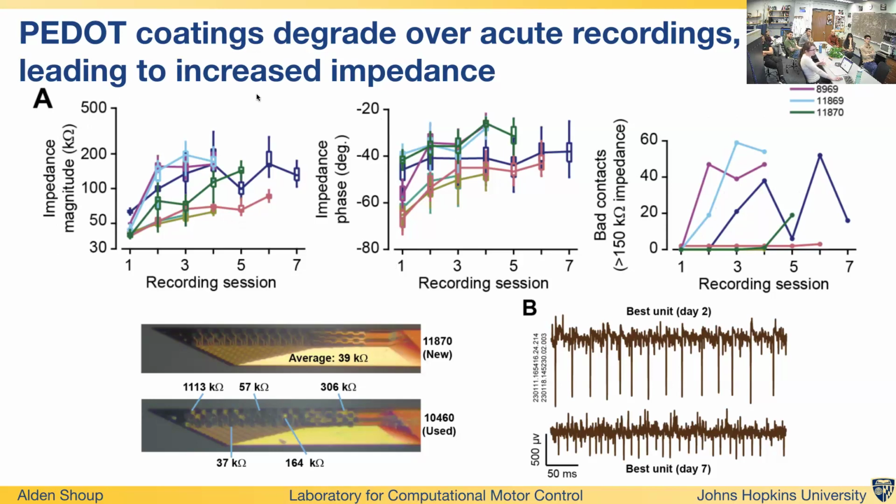You see the effect is more clear in that. And impedance tends to change on order of magnitudes rather than increasing by a certain amount. You're usually getting a percentage increase every day.